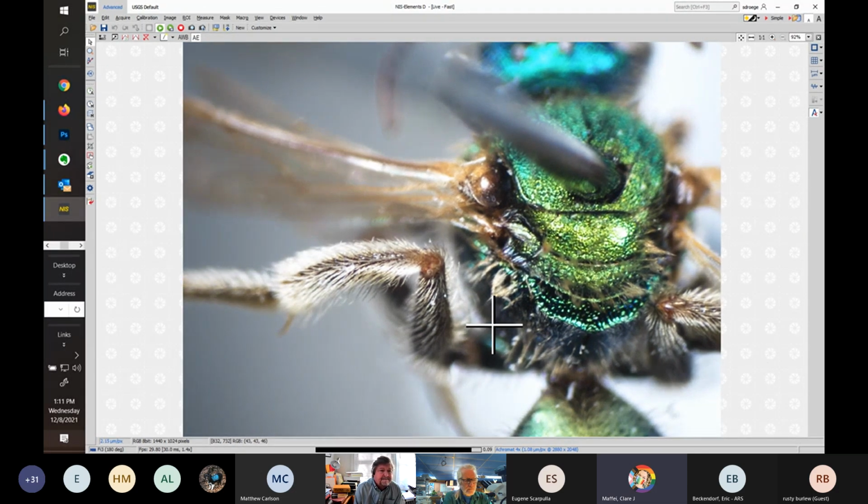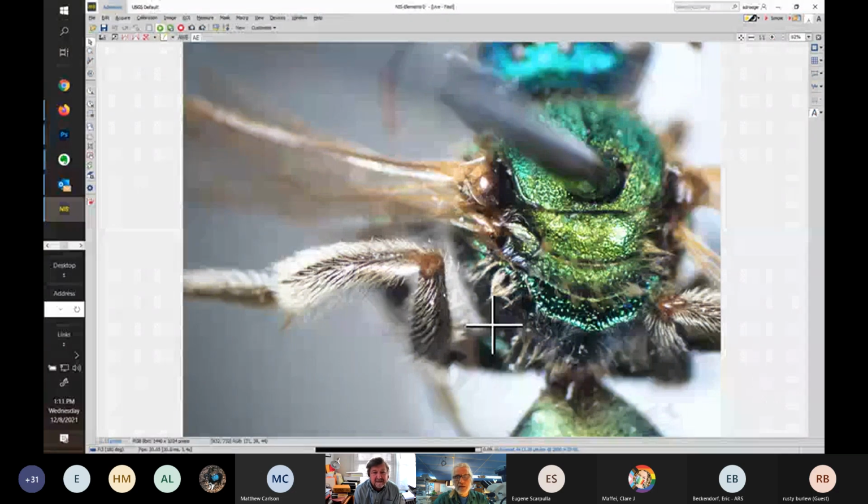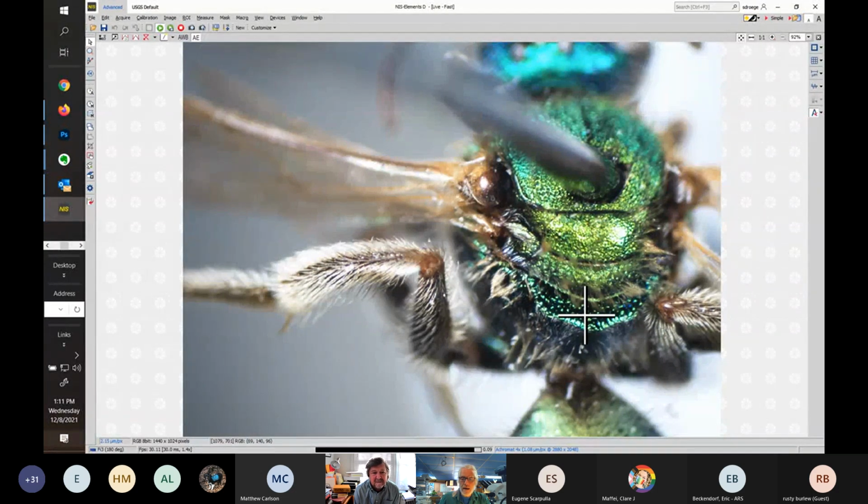So, can we confirm the species on the screen right now? Yeah, I just put up 2 different specimens, which I would call aurata. The first one had quite a wide longitudinal length of the propodeal triangle, the roughly triangular area on the dorsal side. In the advice for gratiosa, you compare the longitudinal length here to the scutellum and the metanotum as a relative measure of distance.